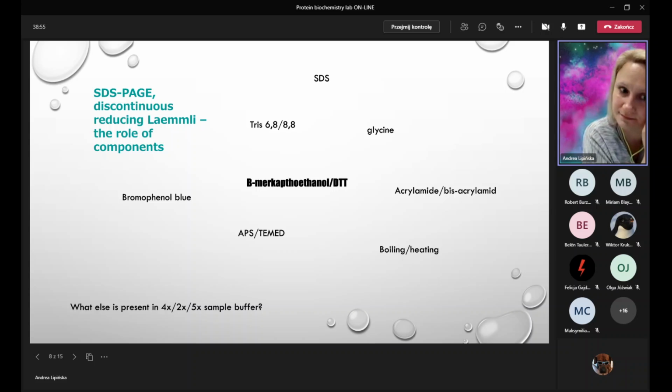Its pI is about 8.8, I think, but I'm not sure. Oh, it's lower, a little bit lower, maybe. That's right. I think somebody checked, it's like 6.3 or something. So it's a little bit below neutral, and it's quite close to the neutral pH. But that's why it's nicely tunable, okay? Because you can go in this direction or in this direction. And at 6.8, it's a little bit negatively charged, but it's almost neutral.